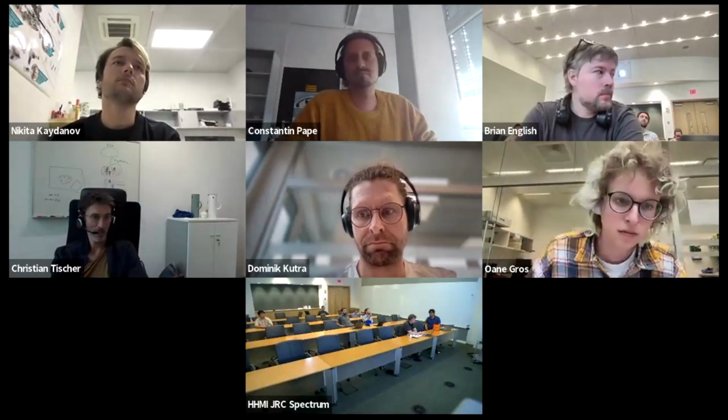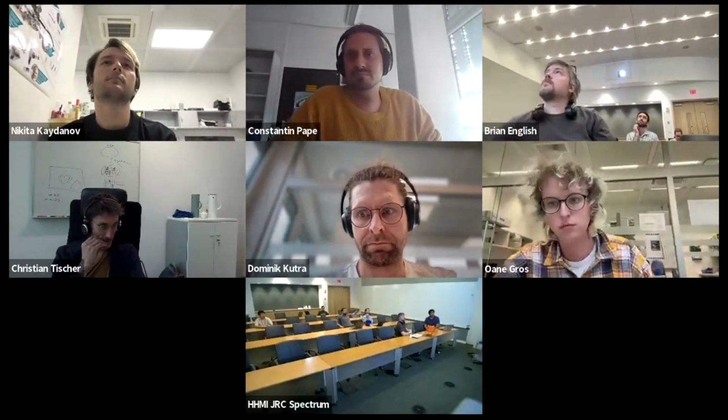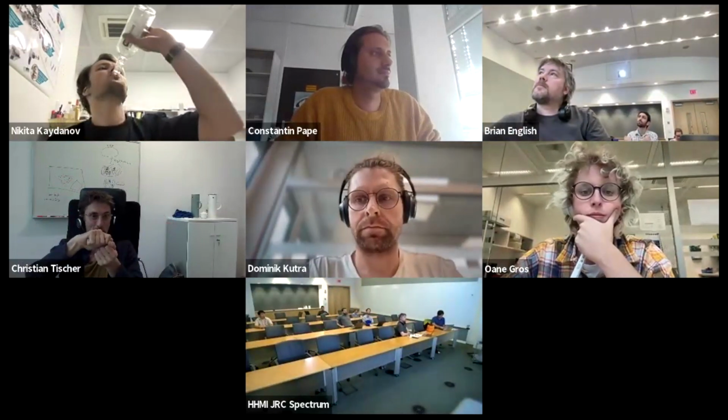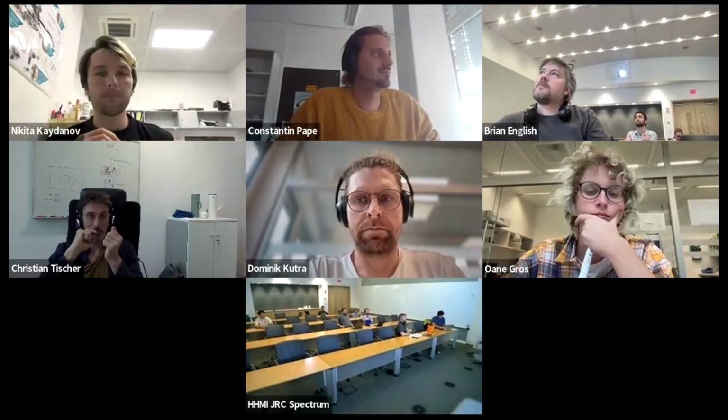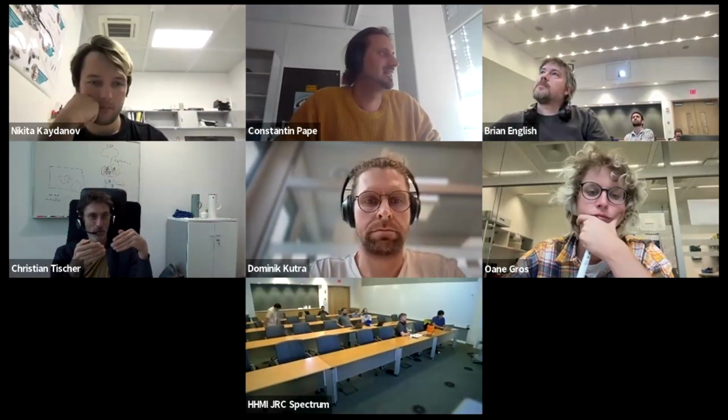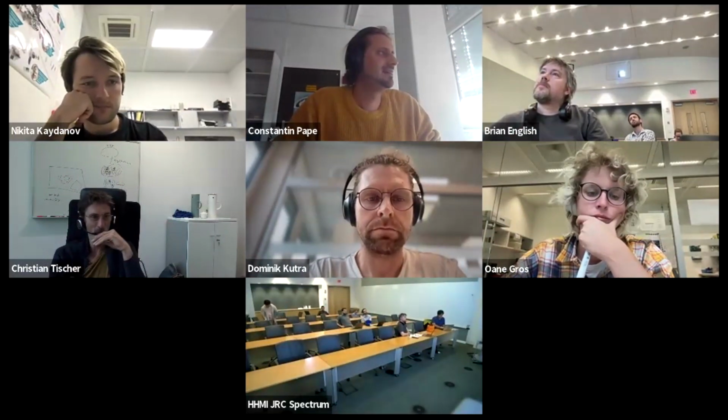All right. I have a question. In this initial video with this frog, sometimes you can have one big object, let's say a cell, but it might have a nucleus inside. So there it looked like if you zoom into the image and then click again, it does something else than if you're zoomed out. Is that how it works?